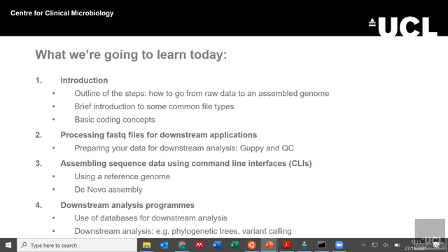This is aimed at Oxford Nanopore data, which is long read sequencing, and a lot of the programs are specifically for long read sequencing, but if you're looking at Illumina data, the principles probably apply in the same way, but you might find that there are different programs to use. And just because I mentioned certain programs doesn't mean that there aren't others that you could also use. These are just simply ones that I have found work quite well for me. So the way I've written the code and the programs that I've used aren't necessarily the only options. Just the option that I'm showing you today.